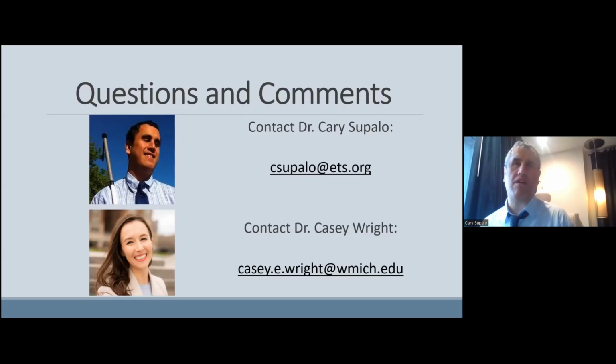And another challenge is we all like to do micro scale experiments to minimize cost to our lab budgets. But everything that I shared with you today is all macro scale tools. So if your curriculum has micro scale processes or standards for a BVI child, at this point, we still need to stay on the macro, so you might need to scale everything for one station. But I hope to someday develop micro scale tools so that we can join you all on the micro scale.